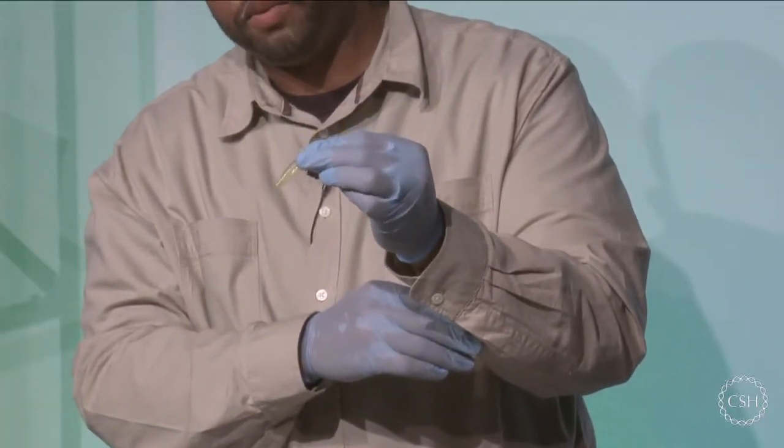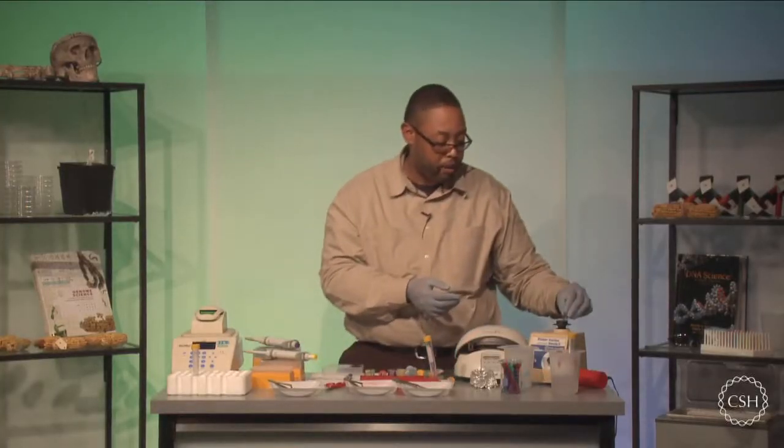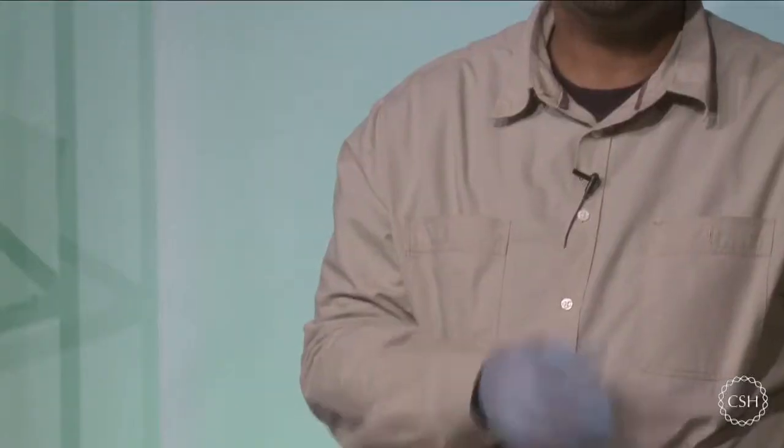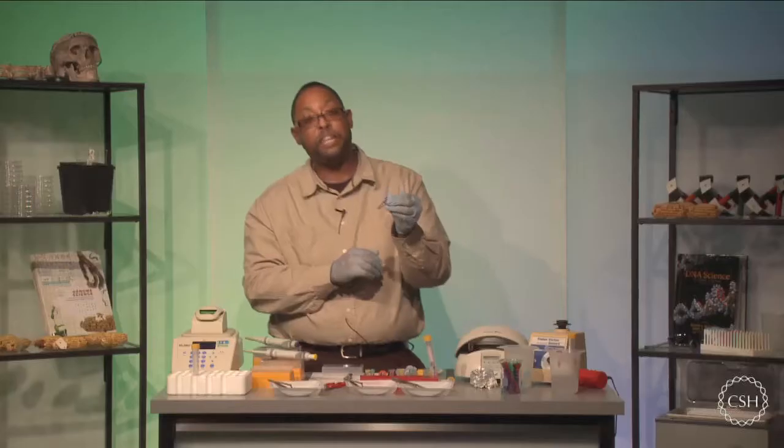And that one's pretty mixed really easily. And for the last one, I'm going to just use a vortex. If you have a vortex, it actually works rather well and rather quickly. But nonetheless, you can do a finger vortexing very quickly. Okay, and I've mixed my sample here.